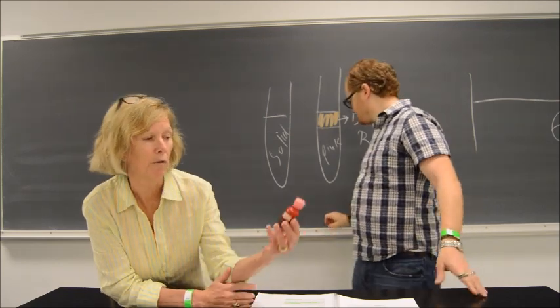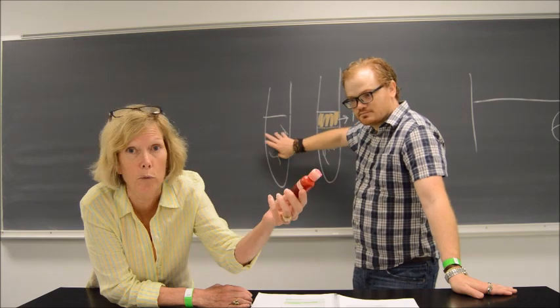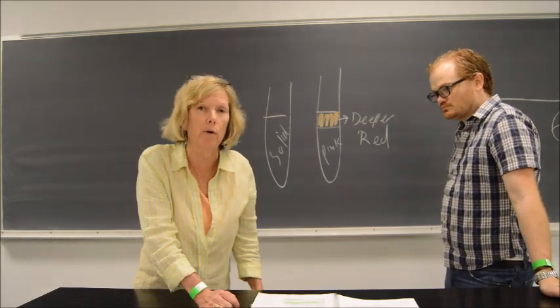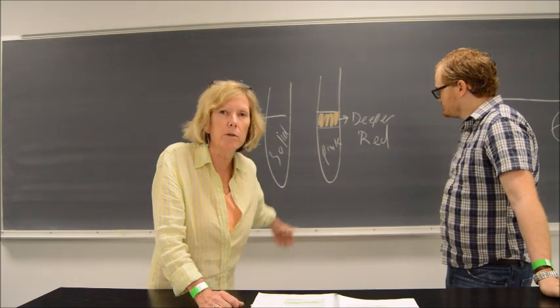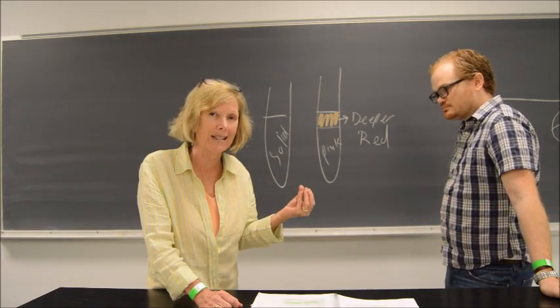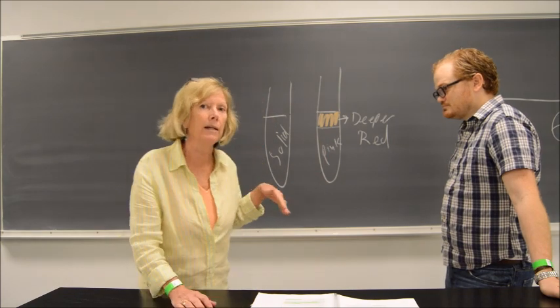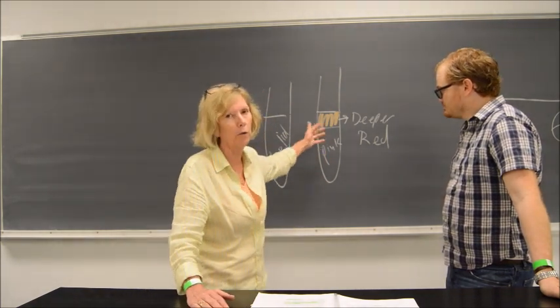So the negative will be a solid red, as Mr. Hopper said. Just water will be red, okay? But you'll see a separation like you do with salad dressing with oil and vinegar, something like that. So notice that the colors that Mr. Hopper drew tend to show up as more time goes by, as the test tube has settled. So when you initially make your test tube, you'll see some layering. And then if it sits there 5-10 minutes, something like that, you'll start seeing the color differentiation.